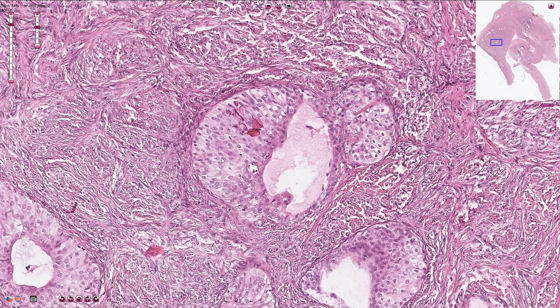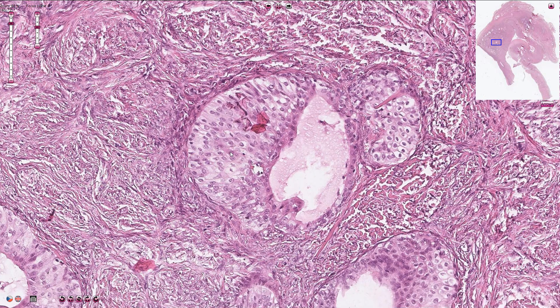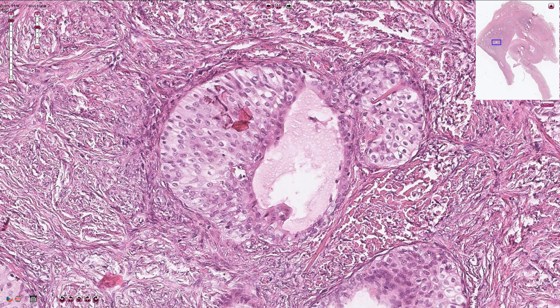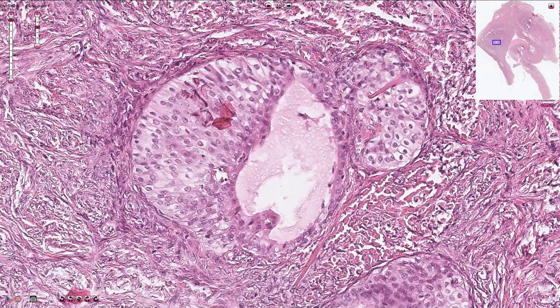The nuclei are quite uniform — they are oval shaped with inconspicuous nucleoli. Sometimes we can see longitudinal grooves, as here or here. Some of the cells have clear cytoplasm.